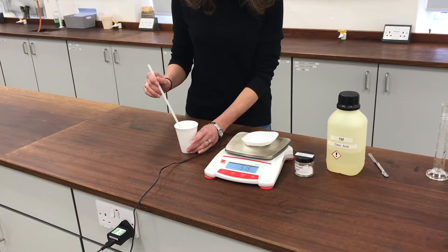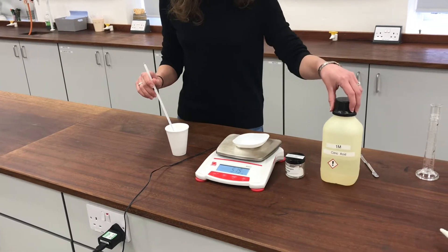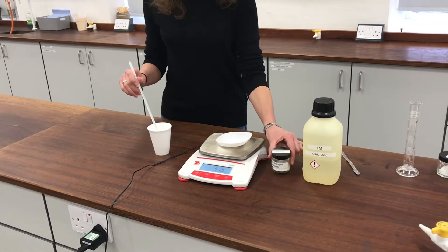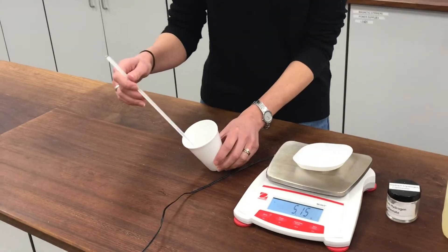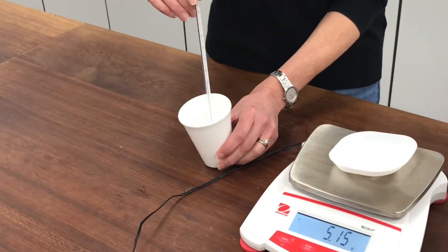This experiment is called the Sherbet Fountain. I'm using citric acid and sodium hydrogen carbonate. I've already put the citric acid into the polystyrene cup — that's 30 centimetres cubed — and I'm taking the starting temperature of it.